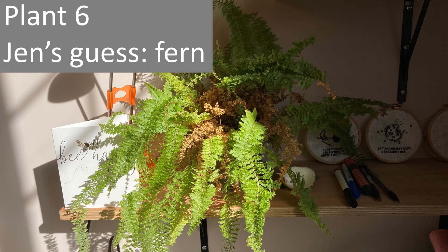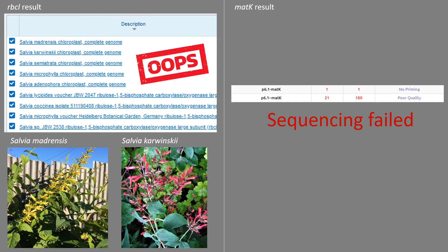Moving on to plant six — my guess was that it was a fern. The RBCL result came back identical to the salvia. Oops — that was a pipetting error on my part. I must have pipetted the wrong DNA in there, so I apologise; that's a shame. And the sequencing results failed for the MATK as well. So we don't know what it is because none of the sequencing actually worked for that one.